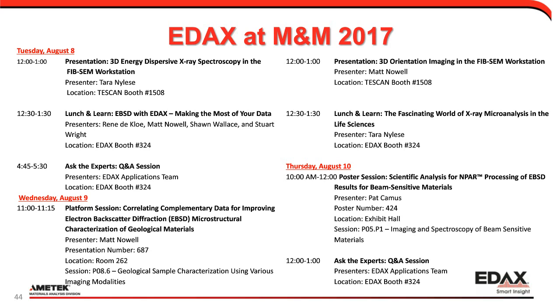And then we're going to also be doing a little bit more on EDS in life sciences. And then of course we have our final presentations, one on correlating data sets, and then the scientific analysis of NPAR that Pat is doing. So again, Pat's going to be looking at the scientific analysis of NPAR.